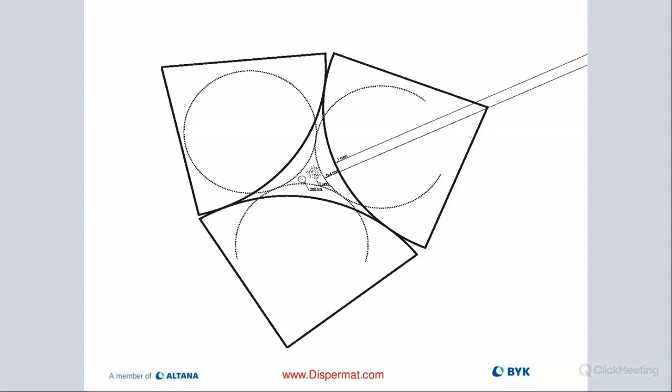Once we mill and these two beads drift together at high velocities, that shearing stress will break up these forces and we'll end up with smaller particles. That's what happens. It happens in these corners as these beads collide. So as my particles are getting smaller and smaller, I should also lower my bead size.